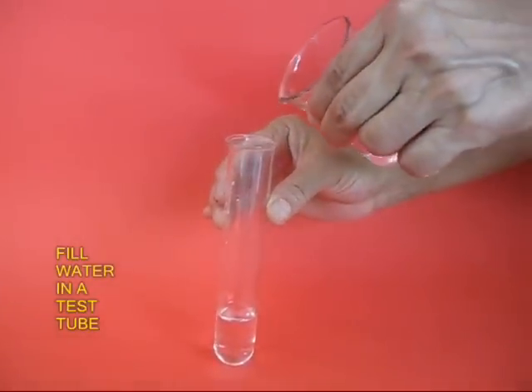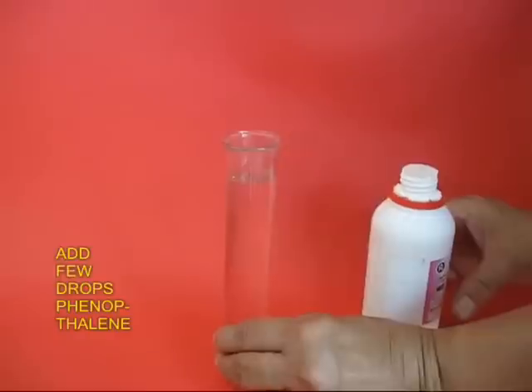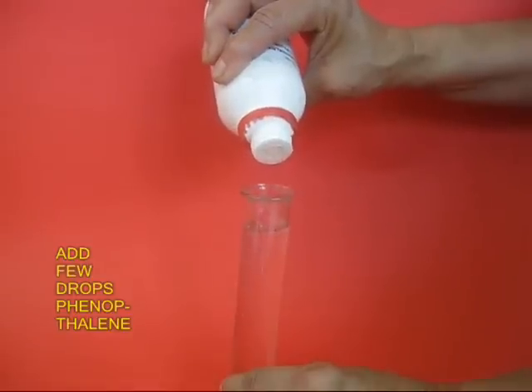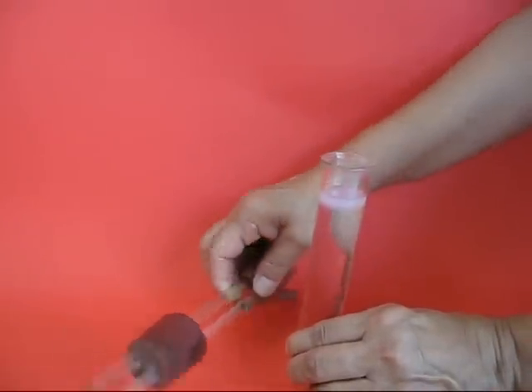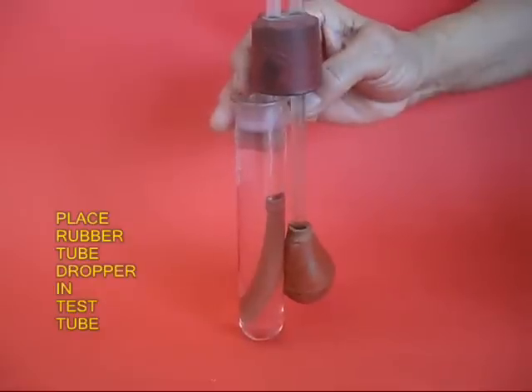Then pour some ordinary water in a test tube and add a few drops of the indicator called phenolphthalein. Now place the dropper as shown, with the rubber tube dipping in the phenolphthalein solution and the bulb below.